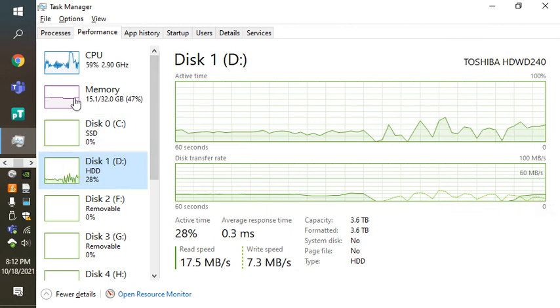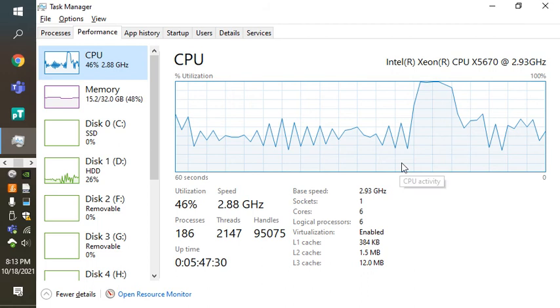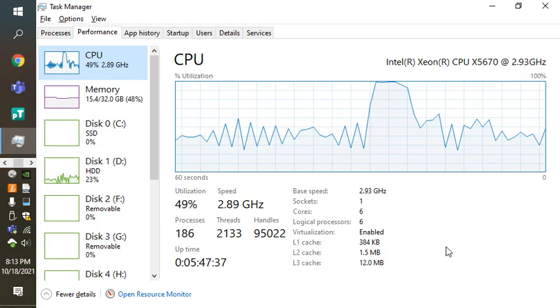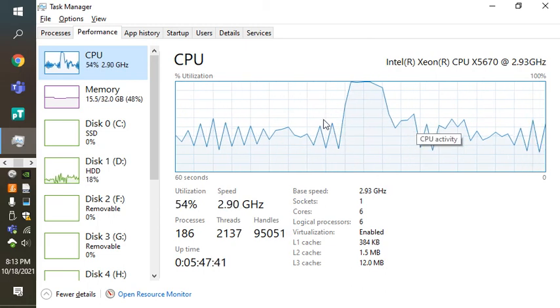But I want you to note that at the very same time that the disk stopped reading continuously, we had this huge spike in CPU usage. That spike in CPU usage reflects the fact that after the raw file is read, we can do the search itself. And that's what this great blast of processor time represents.